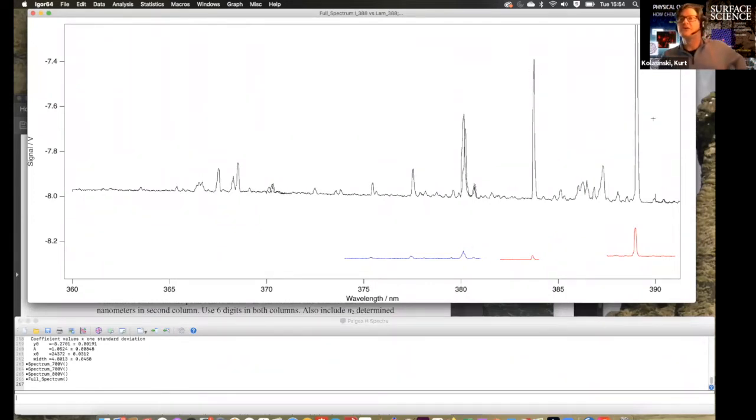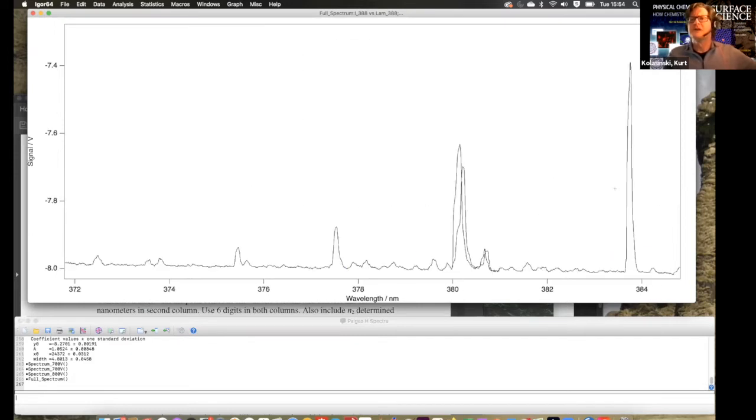Okay, so now we know this is a good peak, this is a good peak. Here we go, here's a good peak. We have overlapping spectra. Yes, now for sure. Okay, that looks good. What about these next ones out here? Well, these might be a little bit problematic as we expand just that region. Definitely, yes, this one has a good shape, goes along with that, falling off in the right intensity pattern.